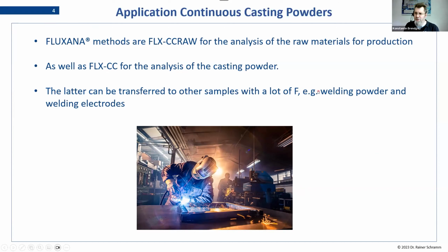What we found in our communication with customers from different industries is that a lot of the knowledge, and a lot of the tricks we use here for these samples, can also be applied to other materials like welding powders, for example, or even welding electrodes, because chemically they are quite similar. So generally, we'll be talking about those two applications today, the FLXCC raw and the FLXCC.